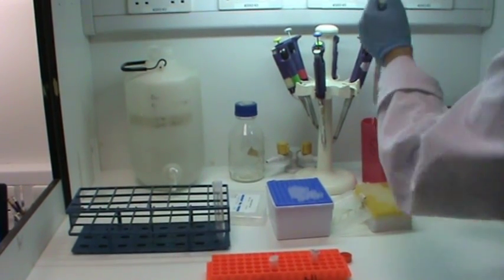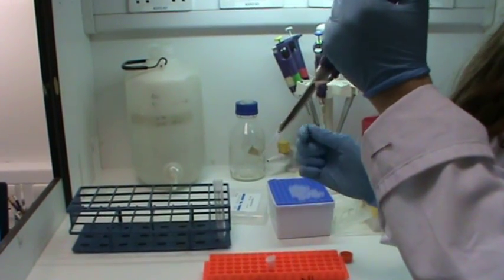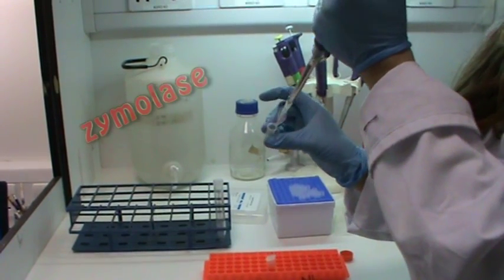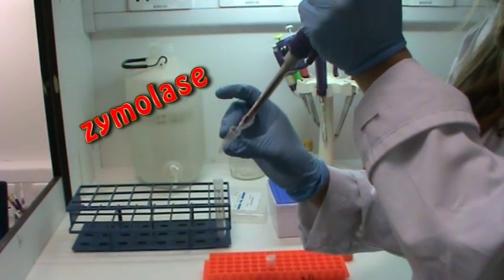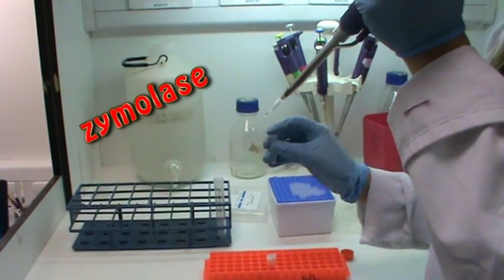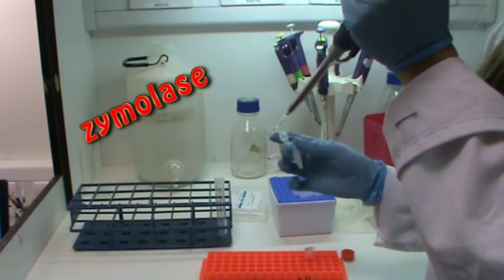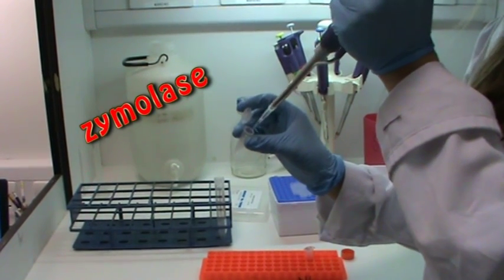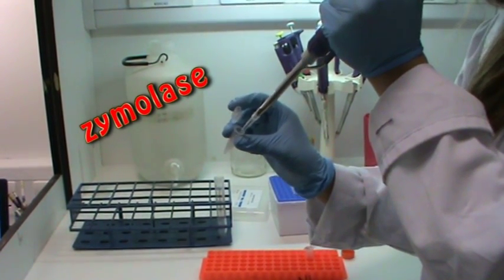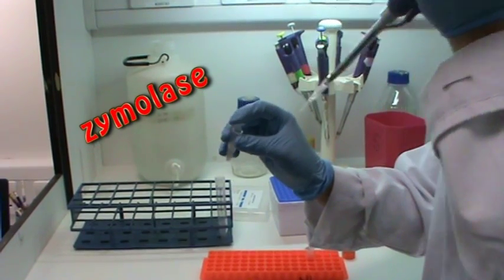To break down the cell wall I am adding the enzyme zymolase. The enzyme zymolase works best at 37 degrees Celsius.